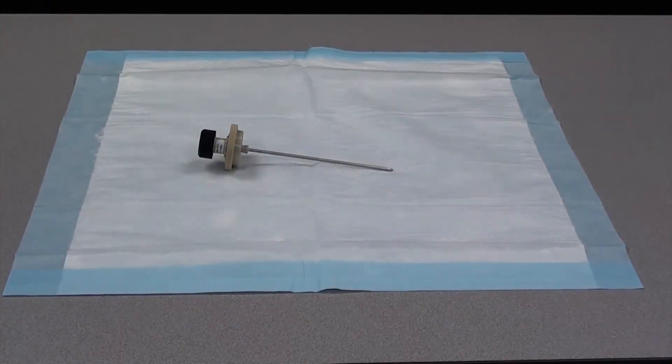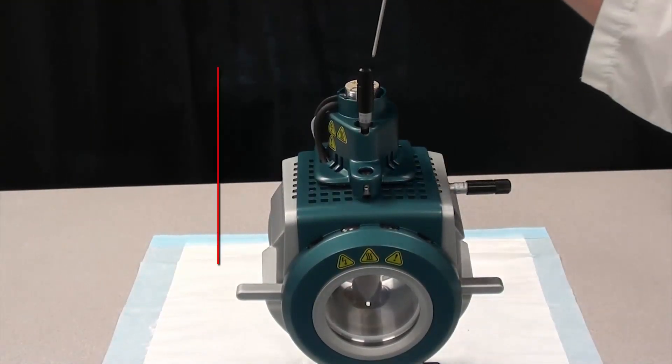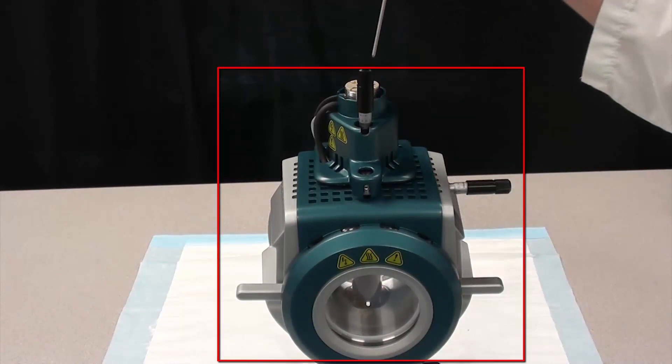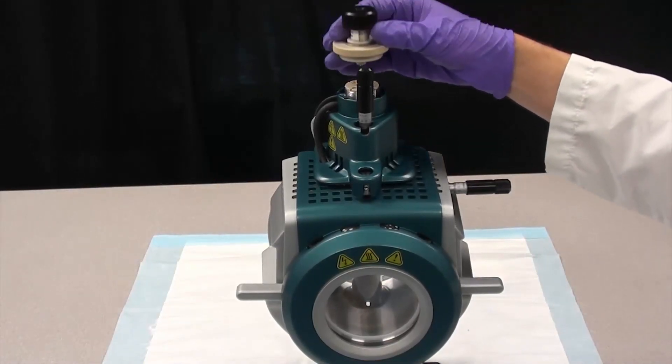To install the probe, insert the probe into the tower. Do not let the protruding electrode tip or the corona discharge needle touch any part of the ion source housing. Align the hole on the probe with the adjustment screw on the tower.